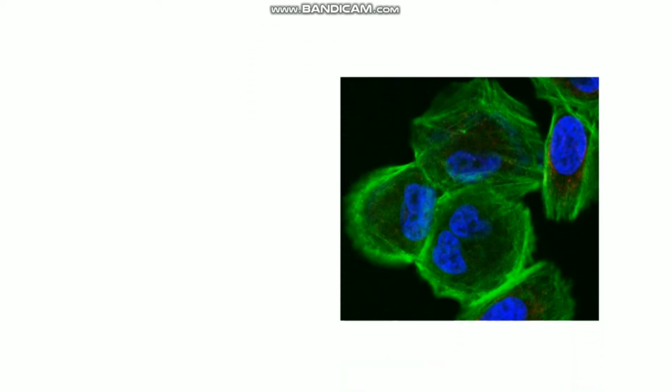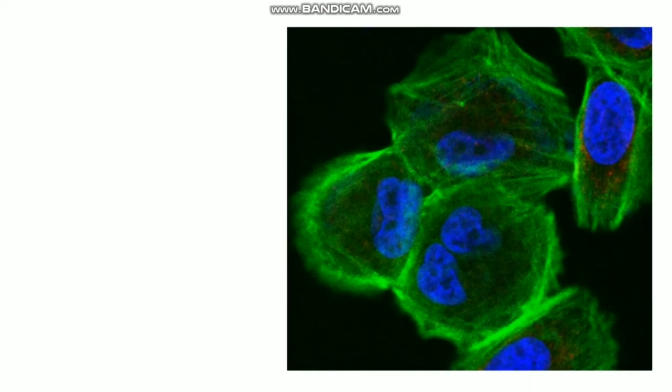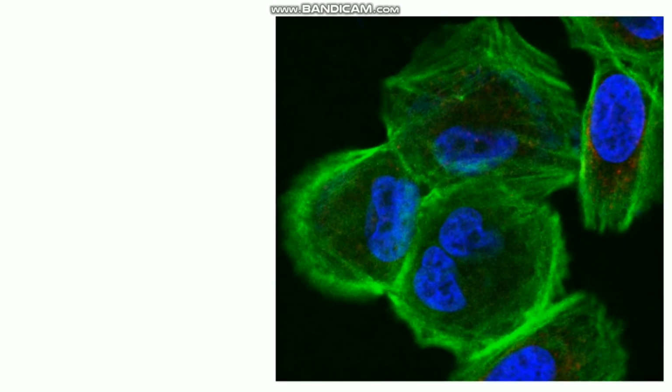In this tutorial video, I'm going to talk about the overview of the cytoskeleton and also the protocol for using F-actin to visualize the cytoskeleton of the cells. Let's begin. So the cytoskeleton is a structure that helps cells to maintain their shape and internal organization. It also provides mechanical support that enables functions like cell division and cell movement.